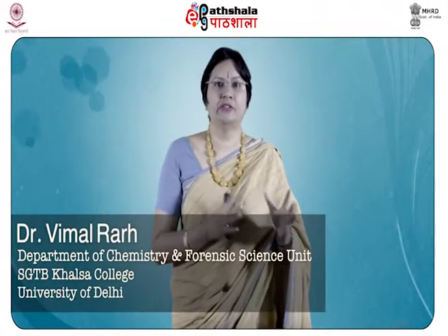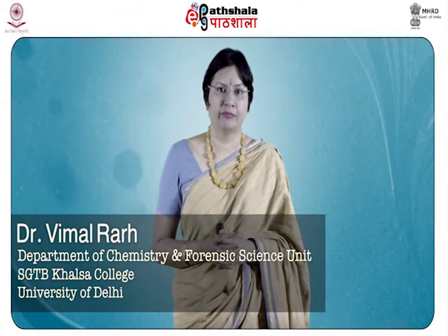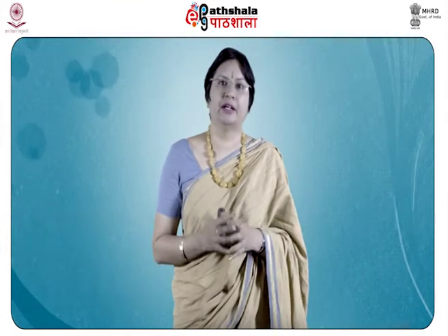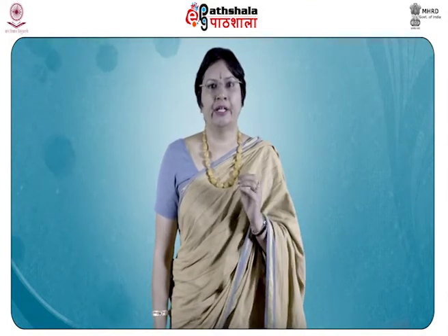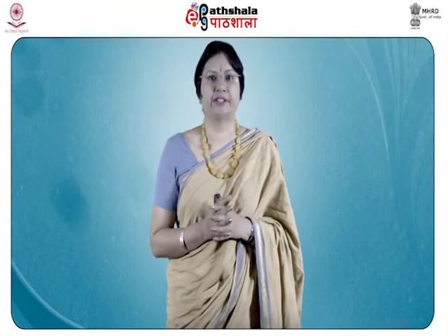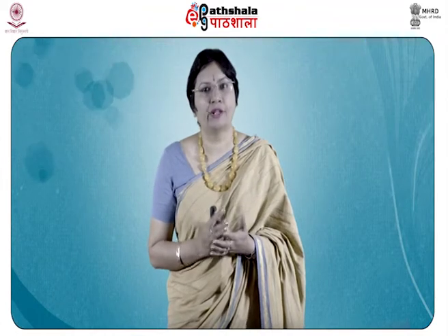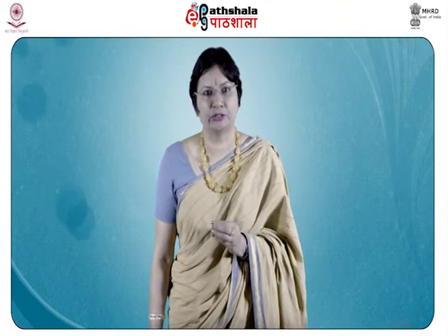You have studied what are the various explosives, the types and how to manage the crime scene. But when you take these evidence of bombs and other explosive material into the forensic lab, then how to deal with the inorganic anions and cations which are there as components of these material or the evidence that you have collected. So, this module shall focus on the analysis of inorganic anions and cations of the post-blast residues.